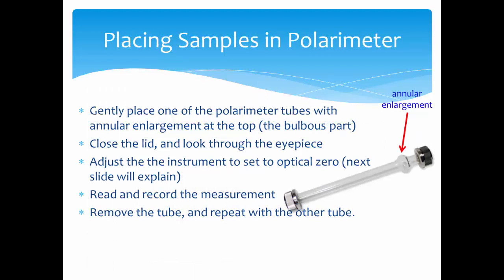To place a sample in the polarimeter, first gently place one of the polarimeter tubes with the annular enlargement at the top, which is the bulbous part. Close the lid and then look through the eyepiece.